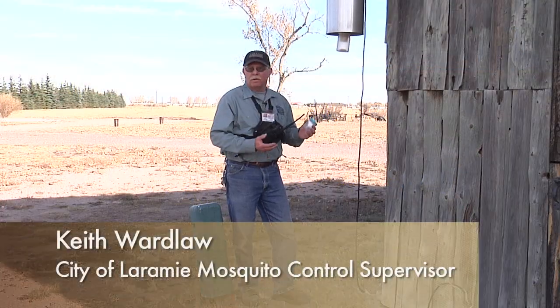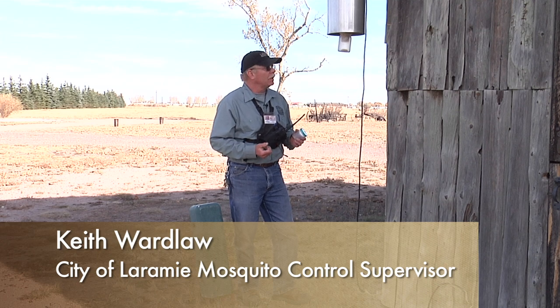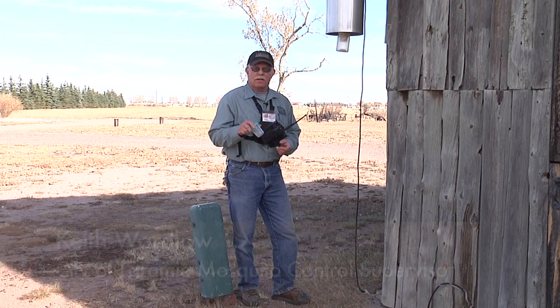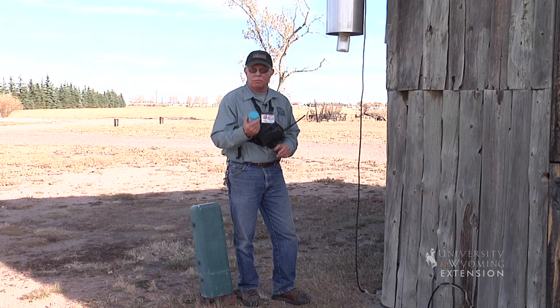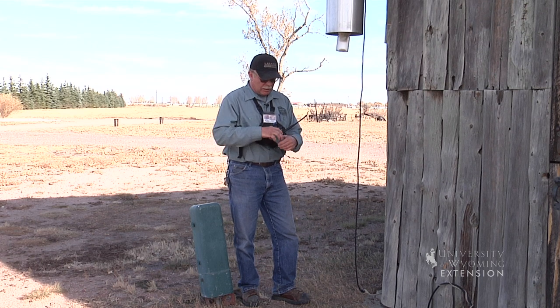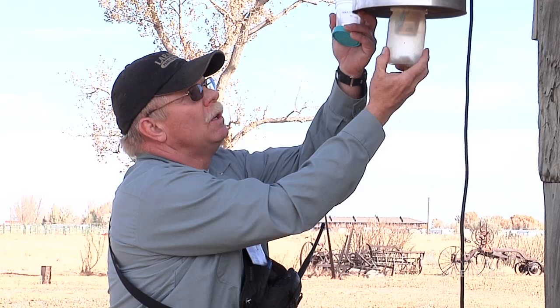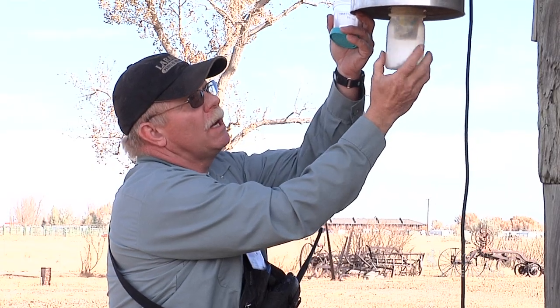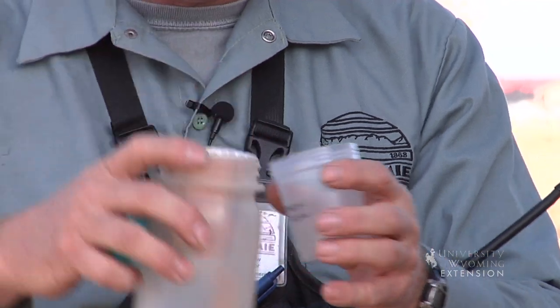The collection procedure for getting your specimens out of a New Jersey trap is very simple. We just use a regular specimen collection cup that you can order from any medical supply house — these are extremely affordable as a method of transporting your mosquitoes. Since the mosquitoes are already dead, we don't have to worry about them flying away when we pull the trap loose, and we can then transfer those mosquitoes from the collection cup on the trap to the one we're going to transport in.